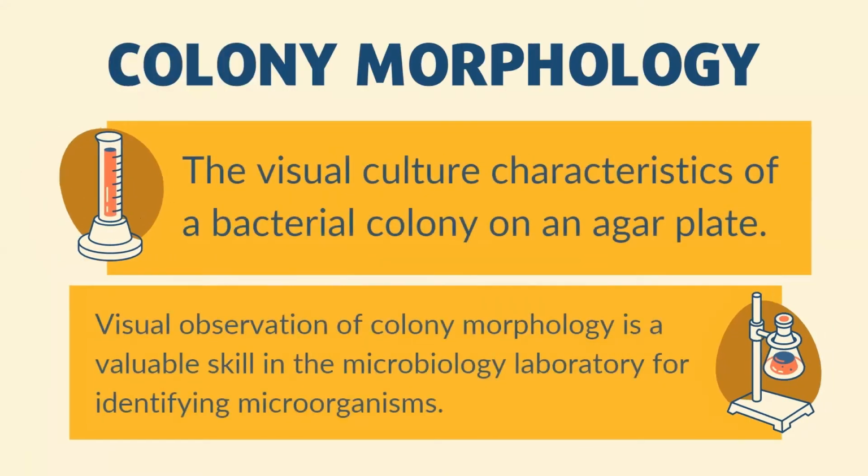Colony morphology is the visual culture characteristics of a bacterial colony on an agar plate. The visual observation of colony morphology is a valuable skill in the microbiology laboratory for identifying microorganisms. So, colonies must be well separated from other colonies in order to observe the distinctive shape, size, color, surface appearance, and texture.